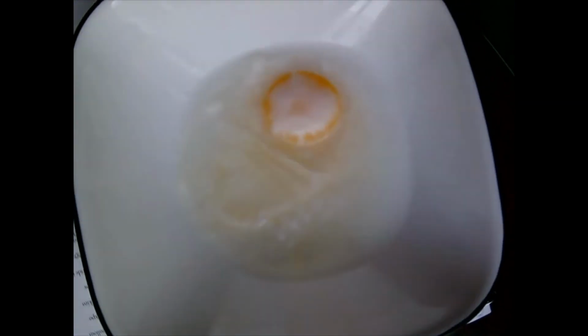And that was the fun part. It was fixation. It was really hard to find something fun to do with it. But we chemically cooked an egg. So if you want to, you can try reenacting this at home. Try some different things. Let me know how it goes.